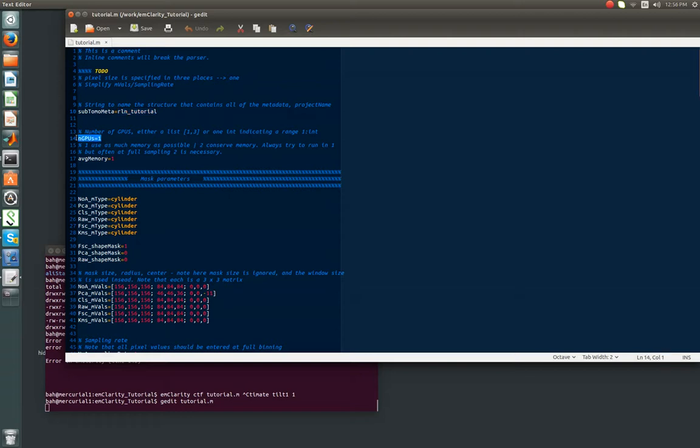We've also defined the number of GPUs available to us. On my test rig, I only have one GPU. If you have more than one GPU, you can specify it as, say, four. And that will select up to four GPUs. Or you can provide a list, like GPUs one and three. The average memory parameter, you're just going to leave as one. When you get to full sampling late in the process, sometimes you have to change this to two to conserve some memory. But in most cases, you're going to leave this at one.